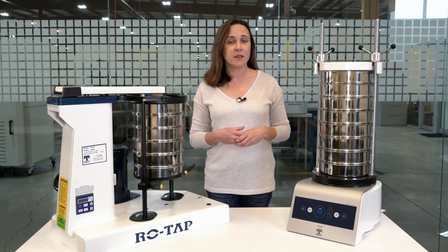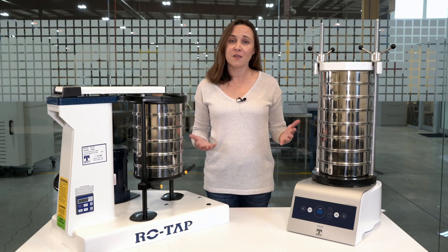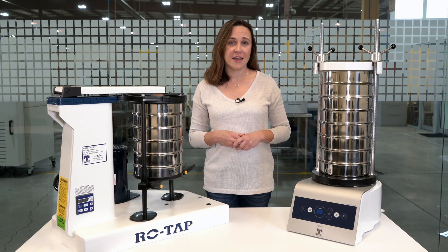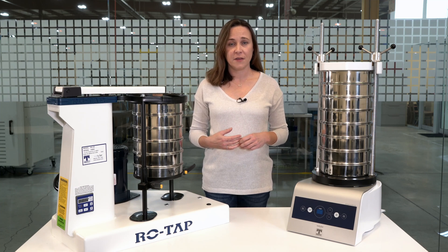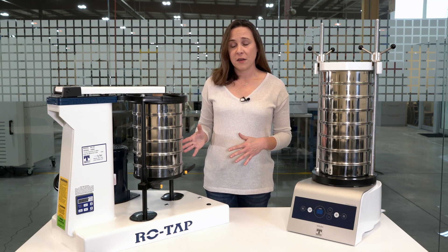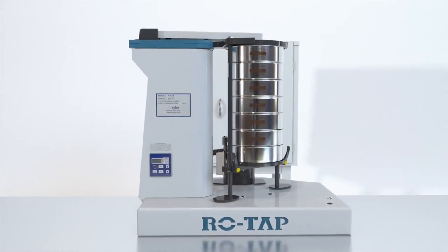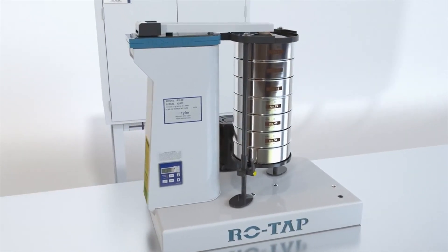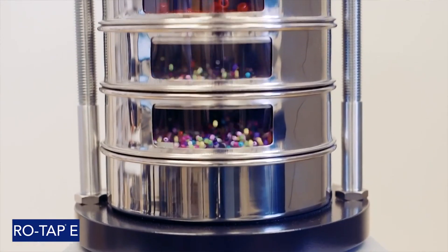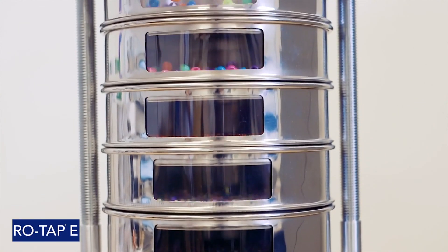There are a couple of differences between the two versions of the shakers. The first obvious one is their size and the amount of space they'll take up in your laboratory. The second difference is the action they use to separate the particles in the sieve. The mechanical sieve shaker has gears and a timing belt to cause the oscillation movement, and a hammer taps on top of the sieve stack to allow the particles to find the openings in the sieves. The ROTAP-E's 3D vibrations stop at set intervals to allow the particles time to find the mesh openings.